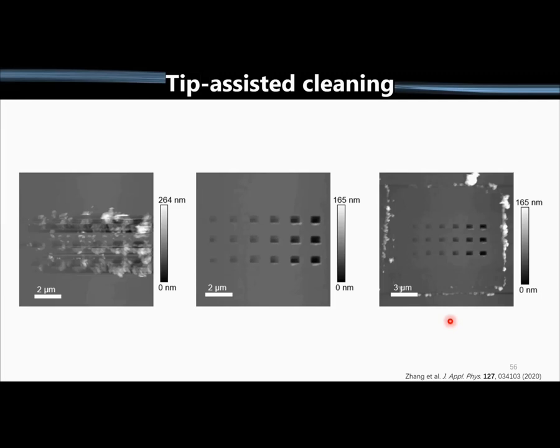All right. So in terms of the resolution, you said that the minimum size you could do is 90 nanometers, right? Yeah, that's the minimum size that we were able to draw just to carve out a material. It depends whether or not you want to have an isolated structure and what the thickness of the film is. If the tip goes down really far, then the aspect ratio is going to define or limit in a way how close you can draw two lines.